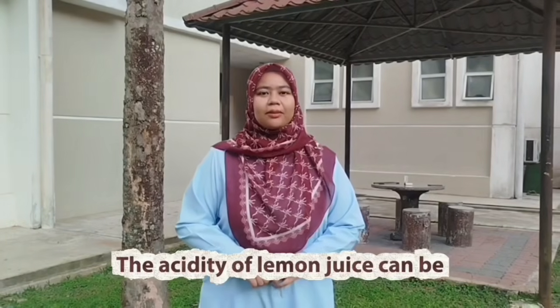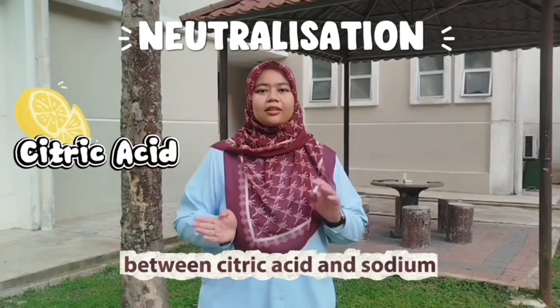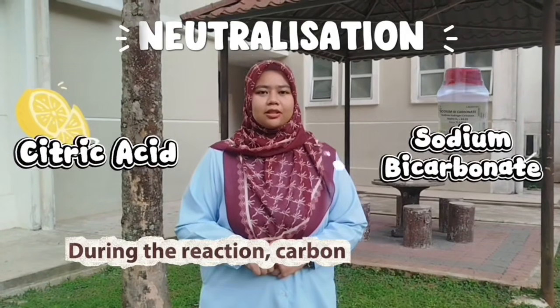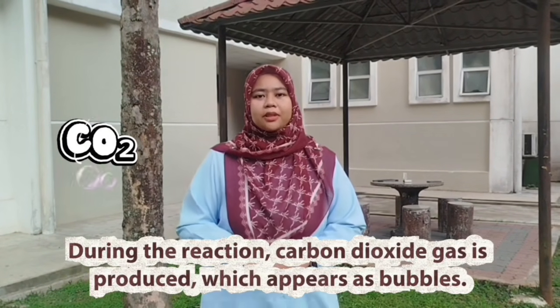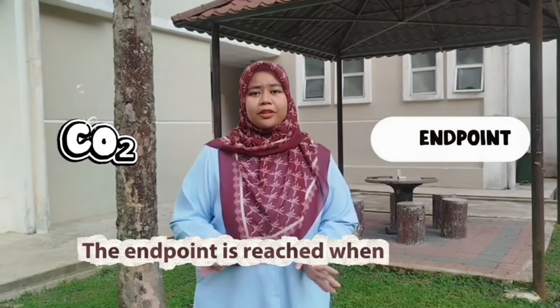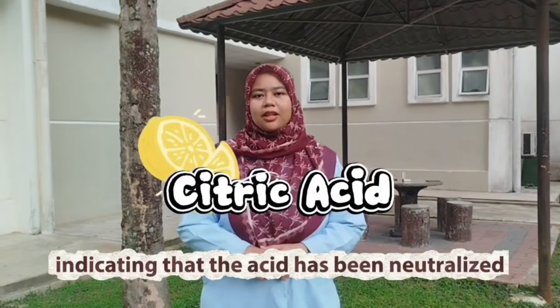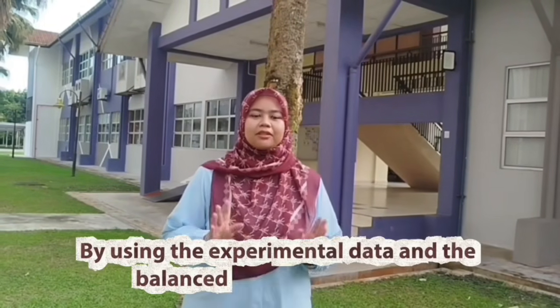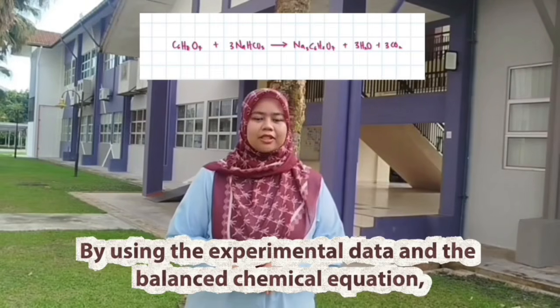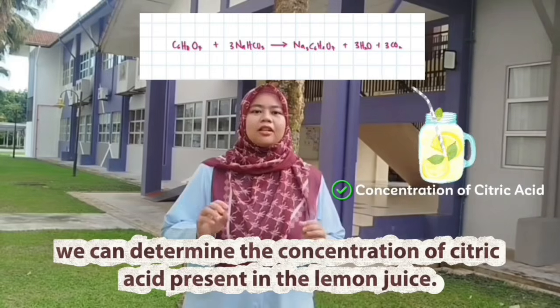The acidity of lemon juice can be determined through a neutralization reaction between citric acid and sodium bicarbonate. During the reaction, carbon dioxide gas is produced, which appears as bubbles. The end point is reached when no more bubbles are observed, indicating that the citric acid has been neutralized. Let's see how the acidity of lemon juice is calculated. By using the experimental data and the balanced chemical equation, we can determine the concentration of citric acid present in the lemon juice.